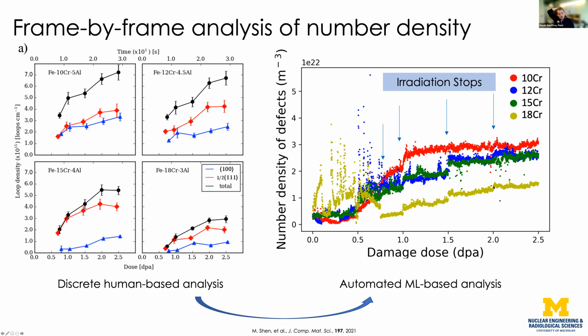It's actually slight changes in field of view and stops in order to do this analysis that's shown here. All right, so in reality, if we knew that we were just going to do video detection, we would have never done this analysis, and you get just a nice, beautiful, smooth curve the whole time. So this is a little bit from doing some dumpster diving for data in order to apply this technique.